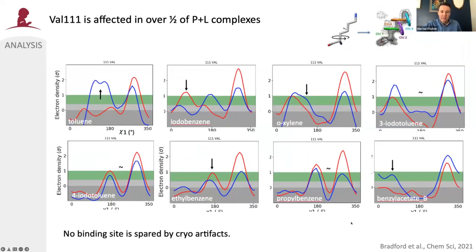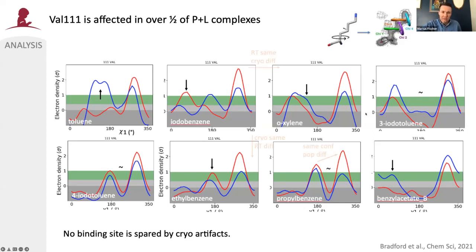Across the nine different pairs we collected, no binding site was actually spared from cryo artifacts — which is alarming for people who take these structures for ligand discovery. One thing to highlight is a residue that causes problems in computation due to high energy barriers preventing it from reorienting on simulation timescales for MD simulations: valine 111. That residue was affected in over half the protein-ligand complexes.